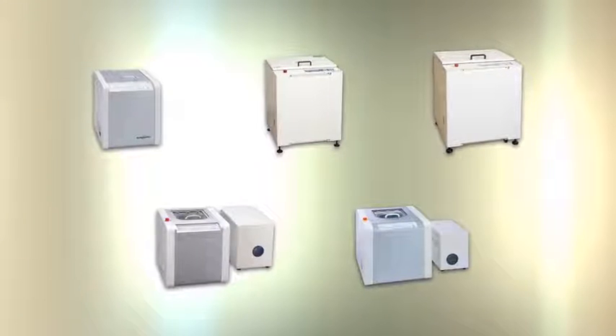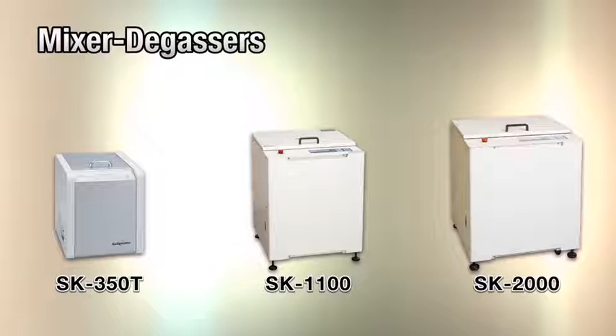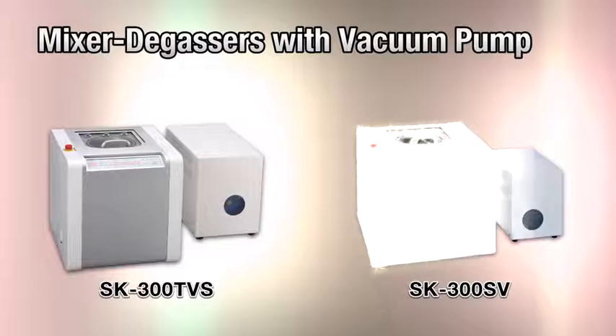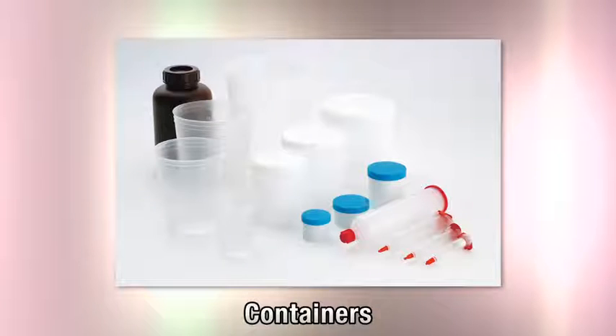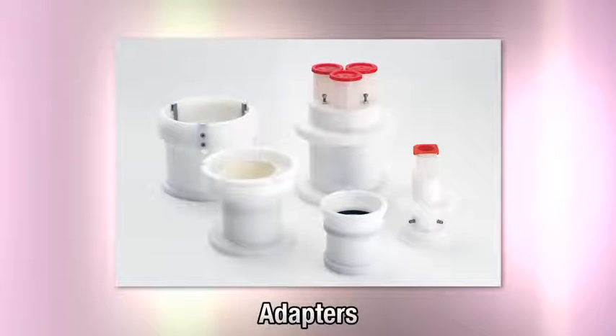The product line-up serves differing processing capacities and material characteristics. Mixer degassers are available in the SK350T, SK1100 and SK2000 models, while models equipped with a supporting vacuum pump are the SK300TVS and SK300SV. Shashin Kagaku has a wide line-up of adapters for disposable cups, stainless steel containers, paper containers, syringes, barrels, glass bottles and tubes, and others.